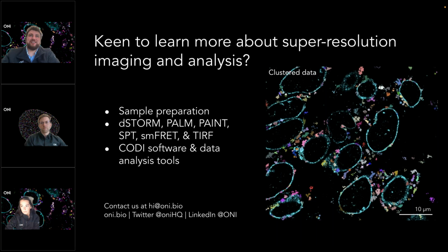Similarly, if you see an EV that looks either interesting or suspicious, then you can click on that and it will take you to the same point on the graph, and you can start to use those numbers to see whether it supports your hypothesis, see whether it's something you didn't expect, and then loop back and compare the different conditions to work out why what you're seeing is what you're seeing.